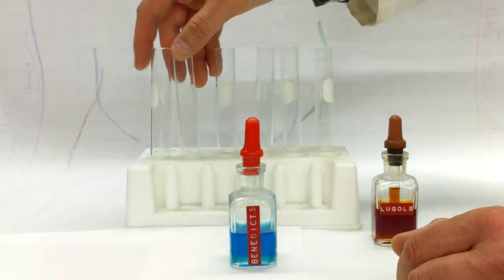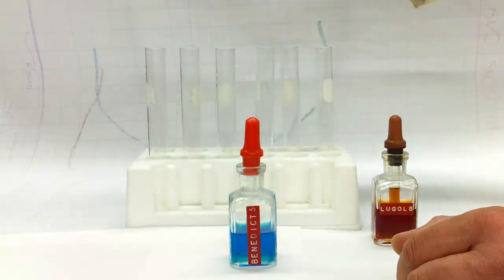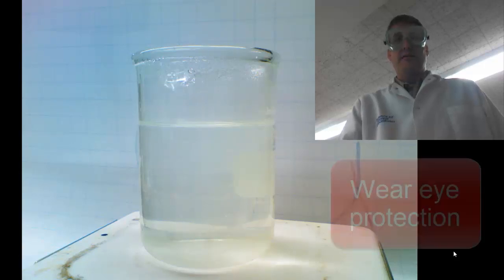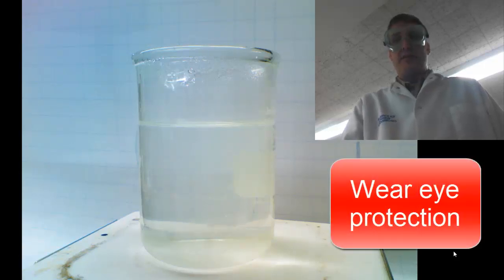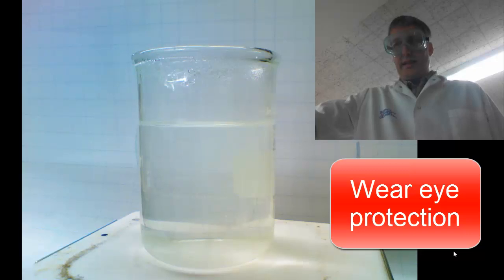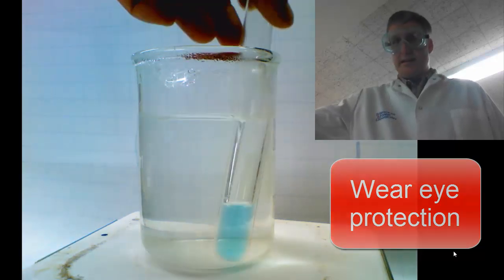So now we're going to put these into the hot water bath for 2 minutes and see what the results are. Remember, when you're working around the hot water bath, you have to have on goggles.